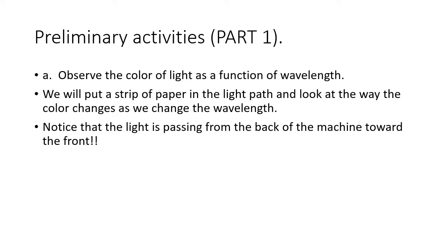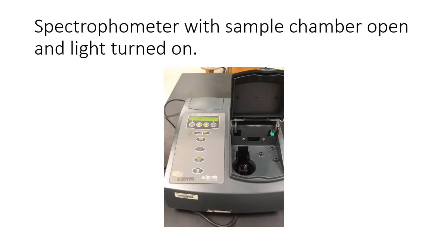And you're going to be looking at the spec, this type of spec. The light path is actually from the back to the front. A lot of them are side to side, but not this kind. You'll see that in a second, the light is actually coming toward you as it's going through the sample.